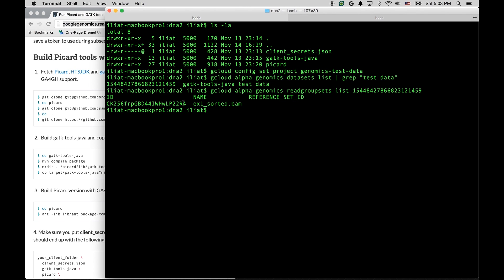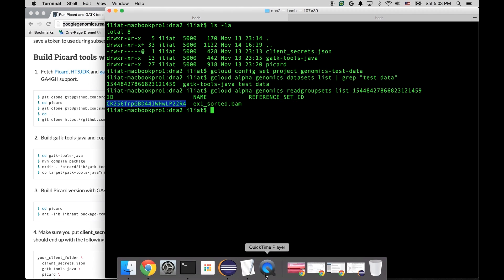Here is our read group set, and we have its ID. It's here, and we're going to need this for the command line that we're going to specify for Picard.